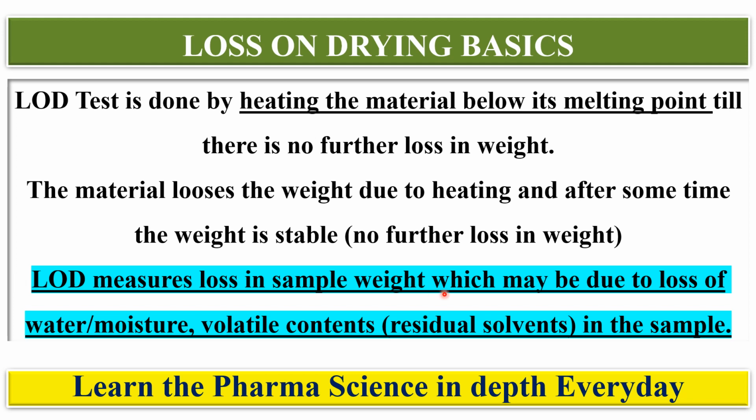LOD measures loss in sample weight, which may be due to loss of water, moisture, or volatile contents like residual solvents or volatile impurities, or whatever volatile material is there, that is captured in the LOD testing. LOD testing captures free water. It does not capture the bound water, because bound water is present in the molecule, and by heating below the melting point it cannot be removed.